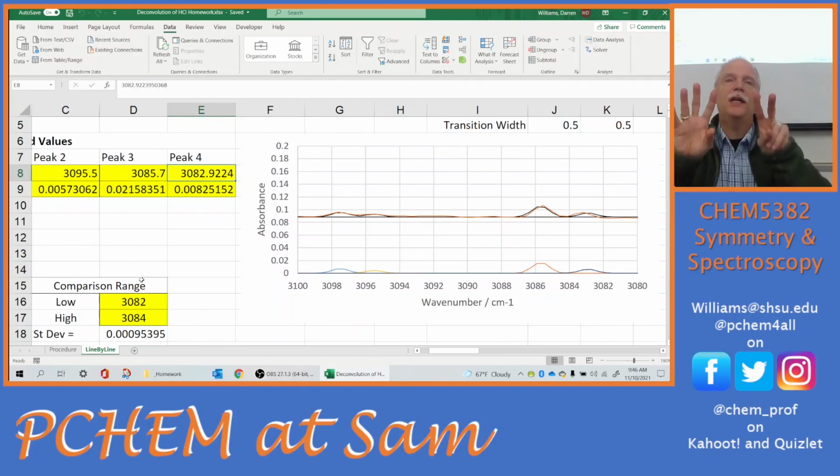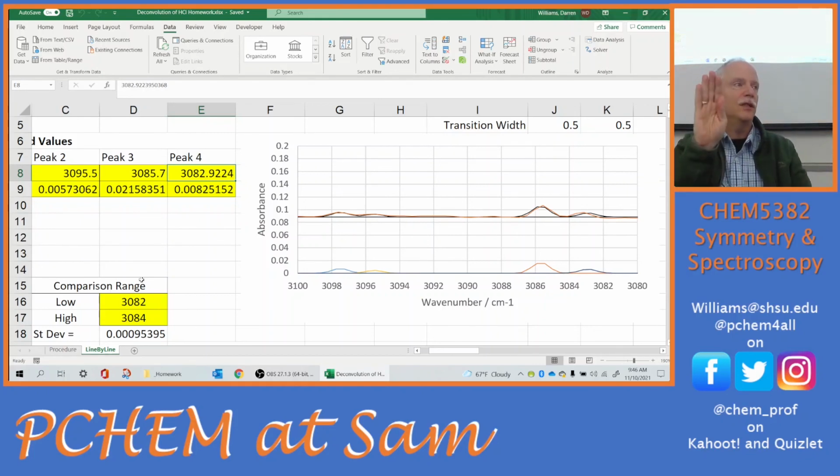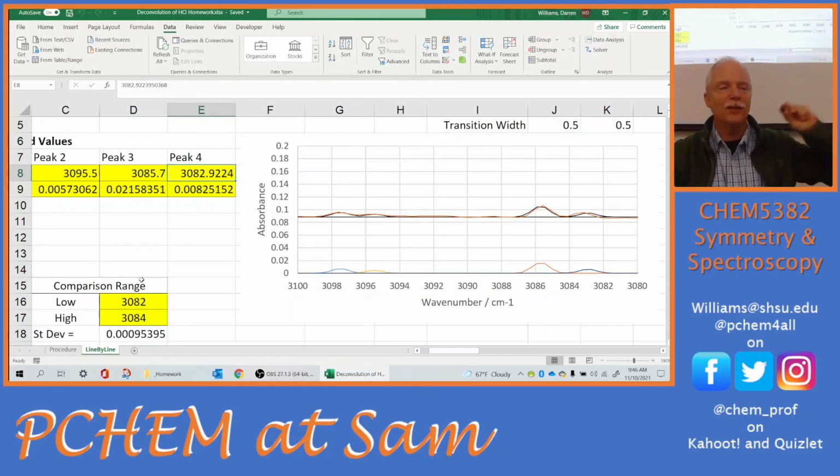What you do is you take the peaks and you reverse Fourier transform them. So then you turn them into a frequency diagram. And so then all of the peaks are essentially cosines, and the highest frequency cosines are the ones out on the tails of that interferogram. You can delete those because your noise is high frequency and your signal is low frequency. So your first huge cosines are your low frequency signal, and the high frequency tail of that interferogram is the noise. So you can just zero it out, and create a smooth function that takes it to zero, and then you do a fast Fourier transform back, and you get a smooth spectrum.